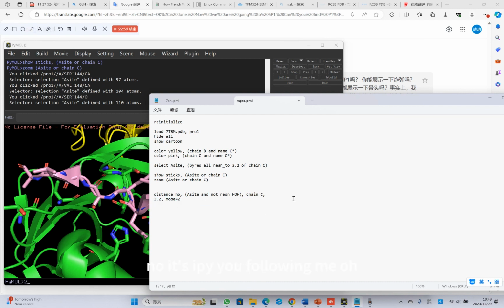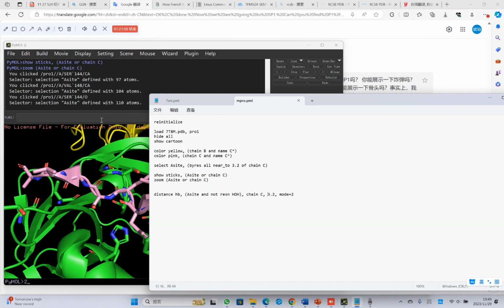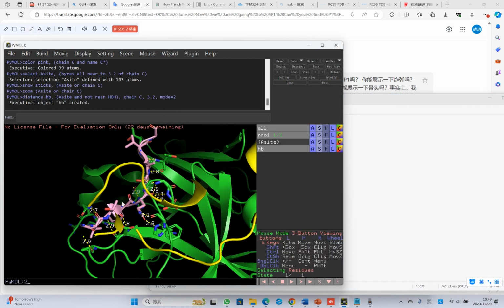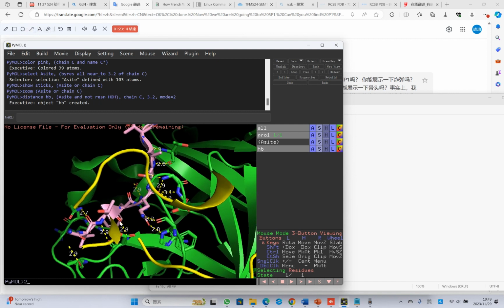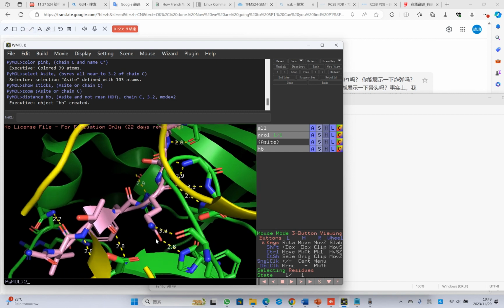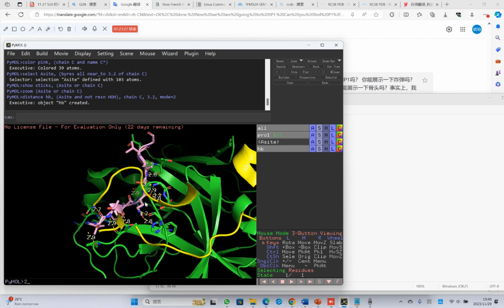You find P1, you found already. Minus 2. Minus 1. 1.